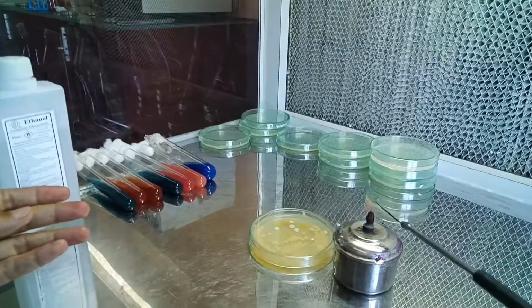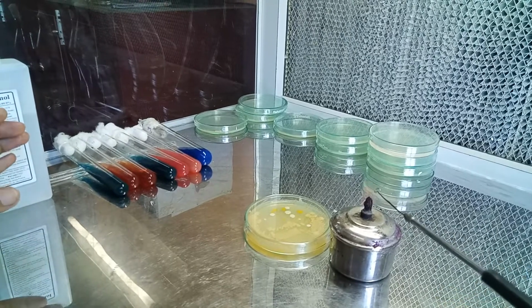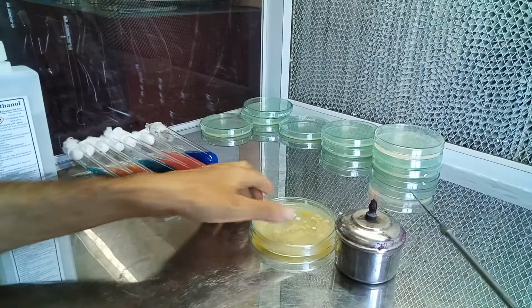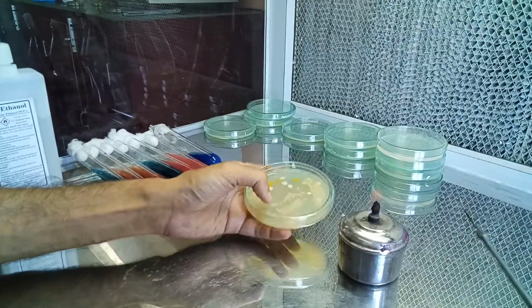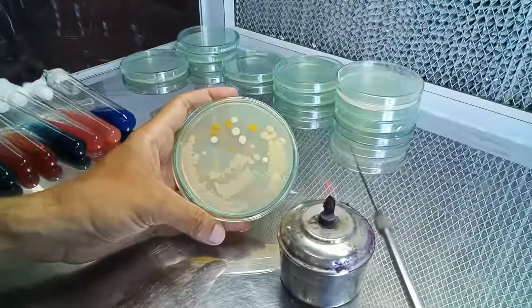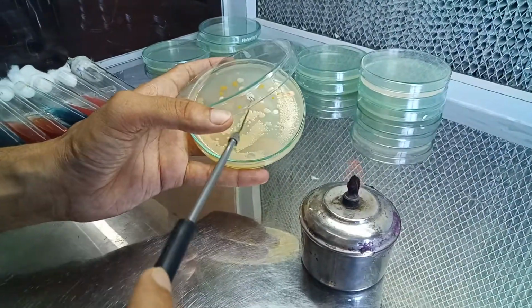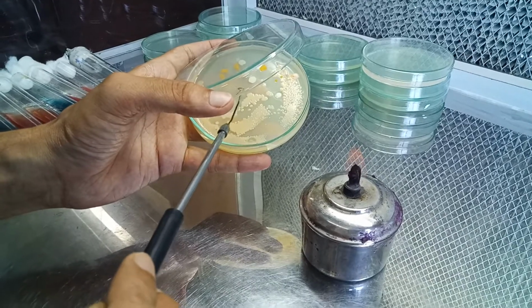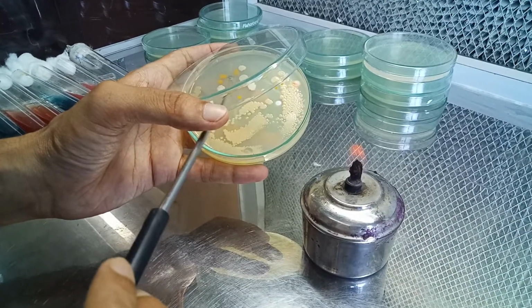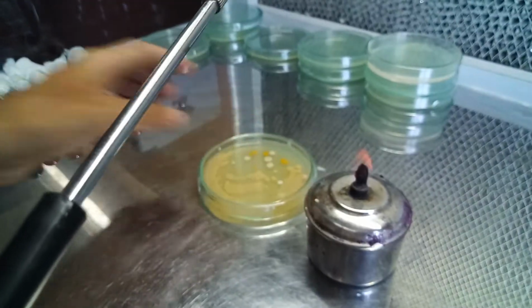So first of all, we will heat the loop. And we will take, this is a mixed culture, we will be taking the yellow color pigmented colony that you can see, which is a distinct colony. So we will take a loop full of the pigmented colony.